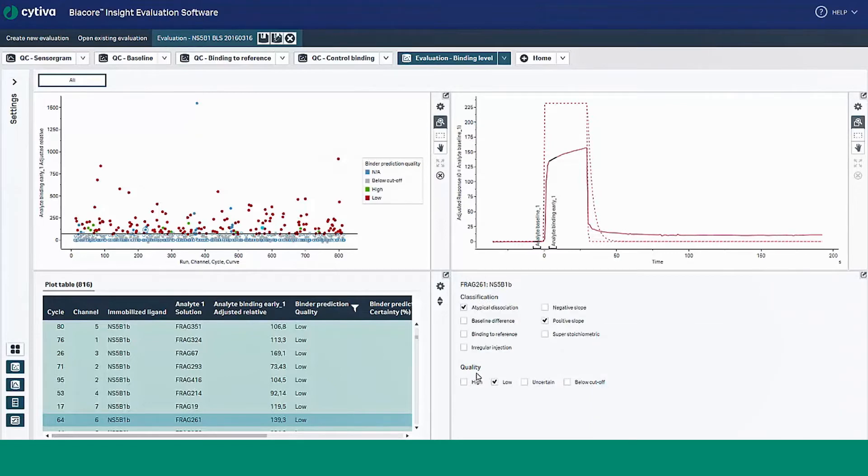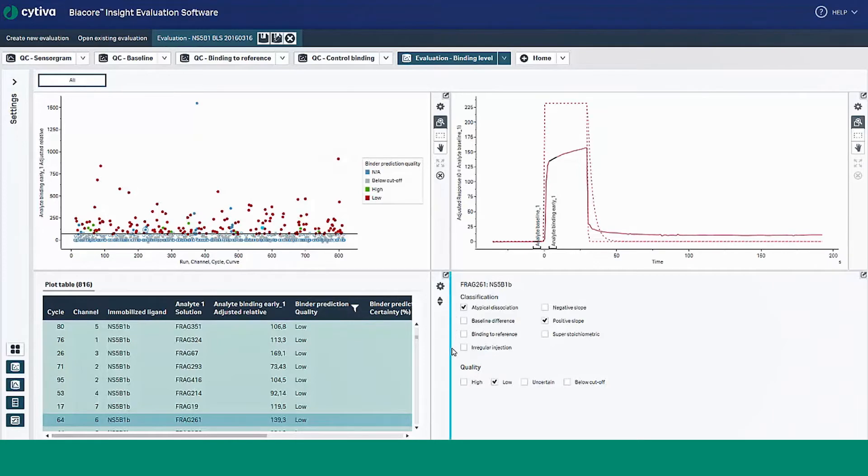Classifications are automatically provided for sensorgrams predicted to have low quality, so you can understand how the quality prediction was made and trace that prediction back to the underlying sensorgram data.